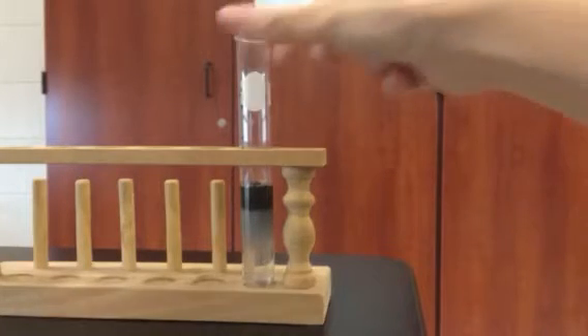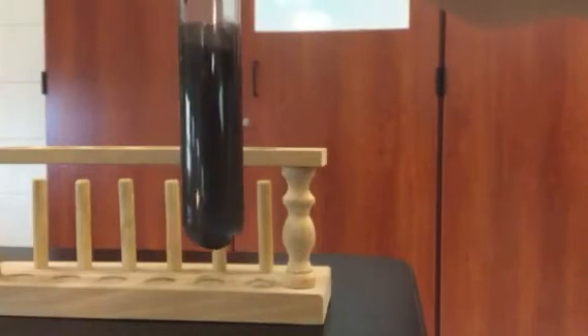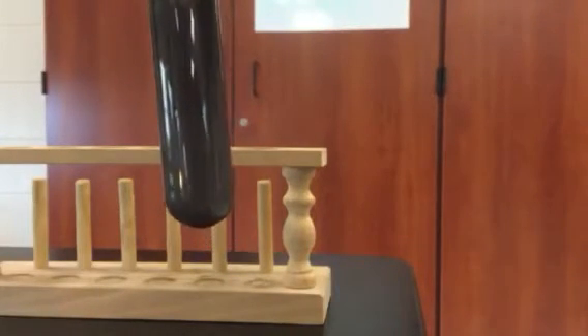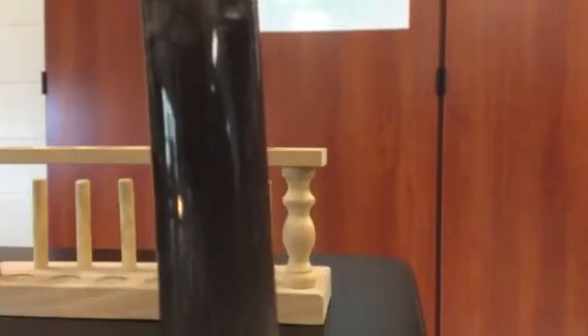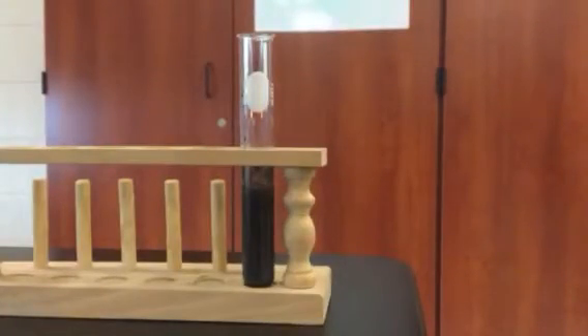I'm going to let that sit for a minute. We'll bring it a little closer so you can see it. Swirl it around just a little bit so it gets mixed in. If we let that go for a minute or two — a few seconds here.